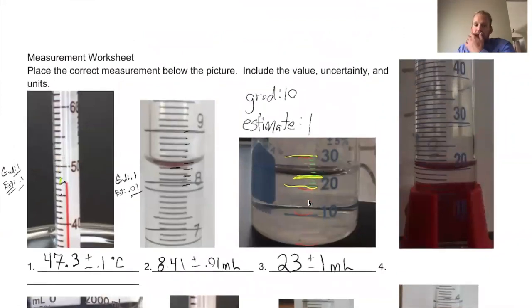That gives you a general idea of how this approach is made when making a proper measurement in chemistry. And what's fun is every tool is a little bit different. Every tool has a different graduate value, therefore has a different estimate. When you talk about precision with tools, precision comes down to which one has the smallest graduate value, and therefore which one will have the smallest estimate value, okay? Tool number 2 here, because it goes out to the hundredths place, allows for a lot more precision than the tool that only allows you to make an estimate to the ones place.